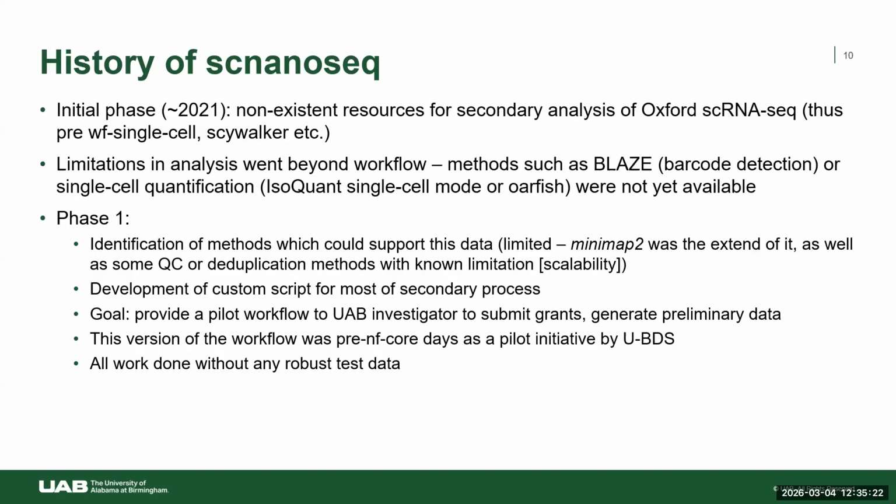And one really challenging aspect of this, which I didn't realize until I started making this slide this past week, is that we did all of this without any robust test data. That was very difficult because all the data available were paired with short-read data, and that was of very low quality. So it was hard for us to validate the analysis.